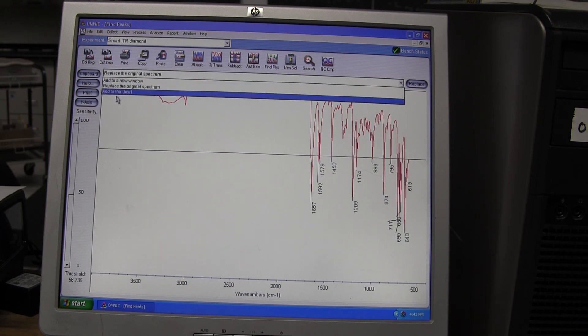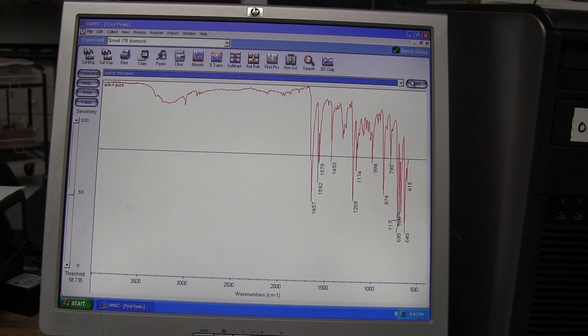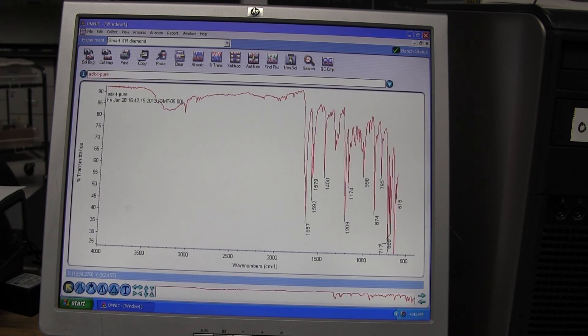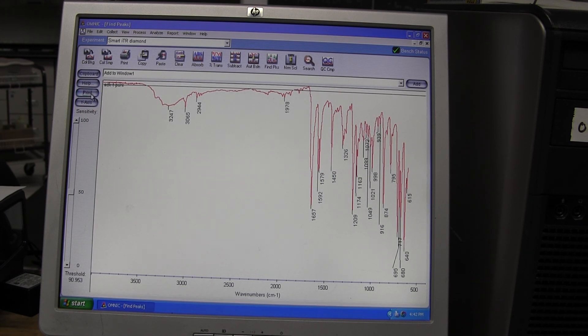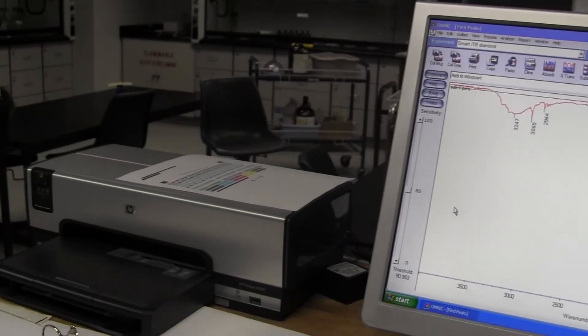On top of the menu, choose the Find Peaks button. It is on the right-hand side. If your graph disappears, go to the drop-down menu below the top bar and choose the window that your sample was added to. Highlight the other data and select Delete. You will then be able to choose the Find Peaks option and print your IR.